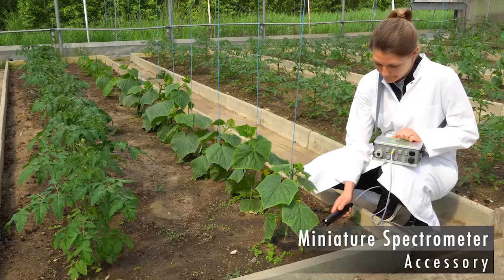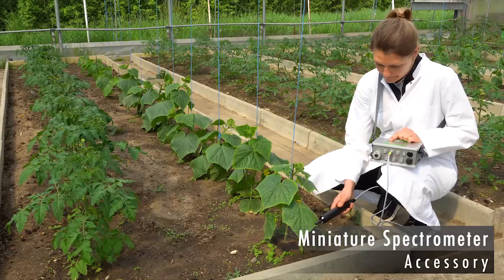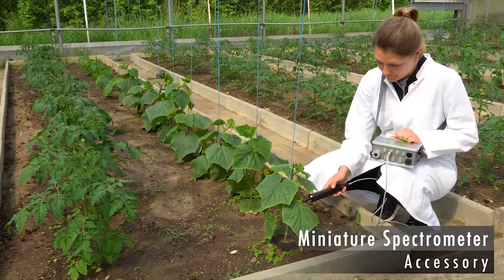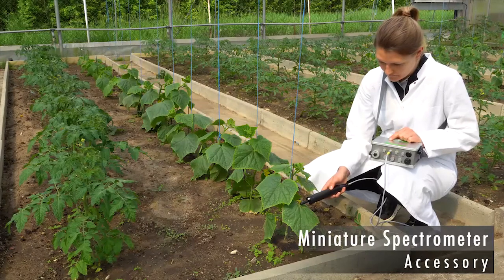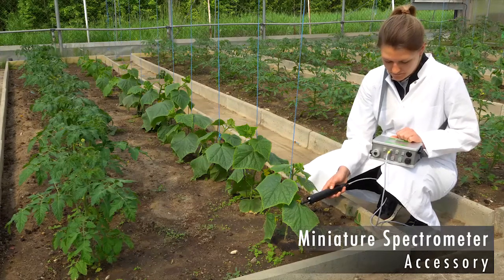The miniature spectrometer precisely examines gradients of intensity and spectral composition of light. Both are key factors for plant growth.